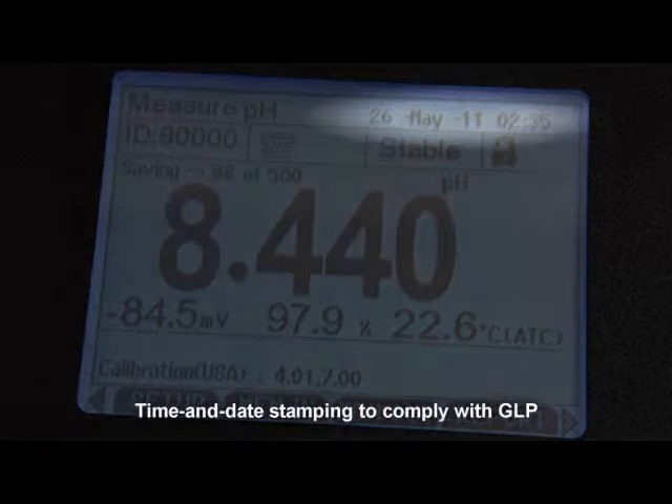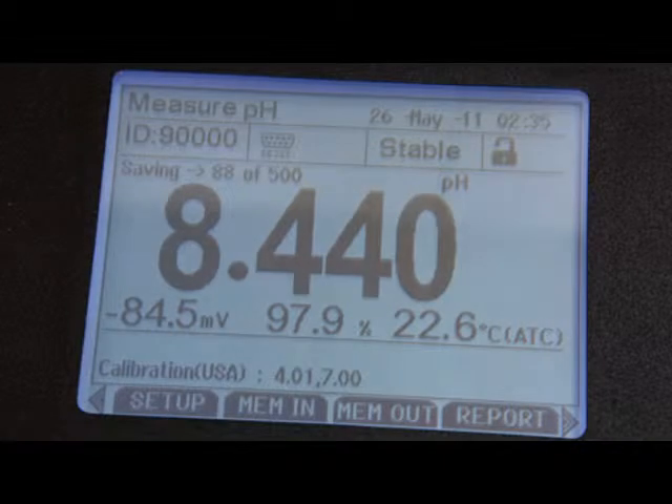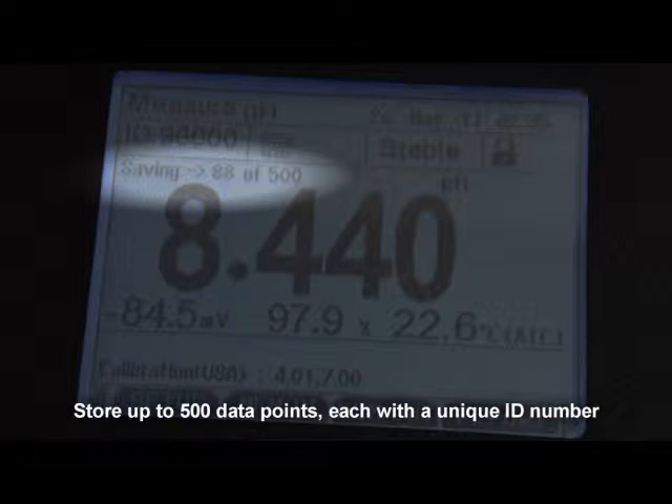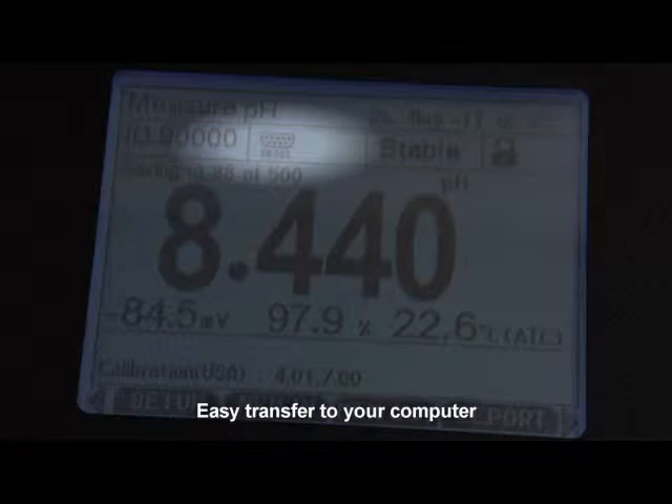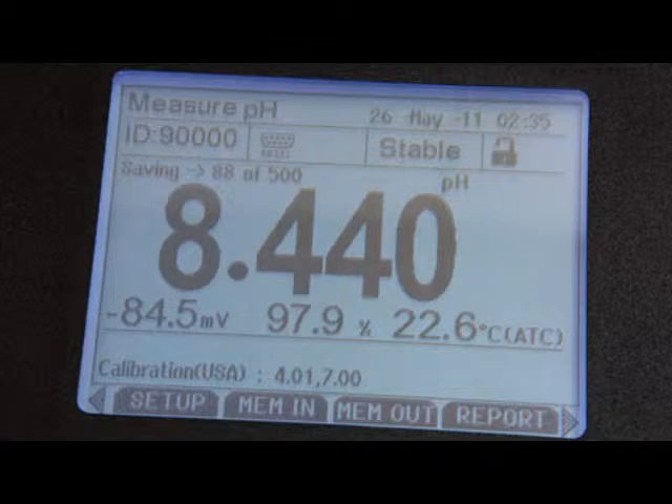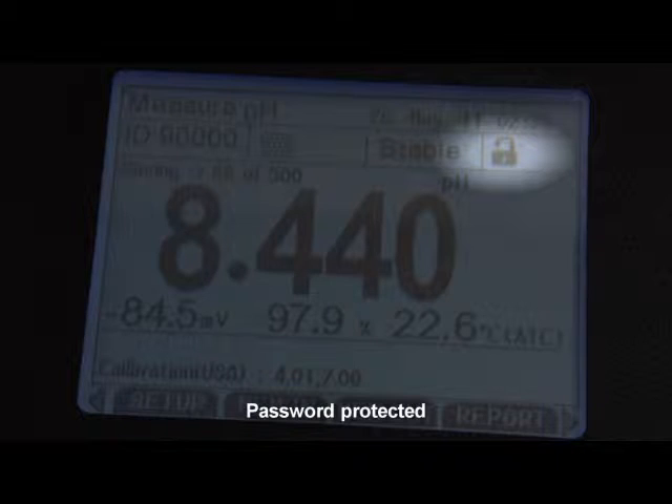Time and date stamping keep you in compliance with good laboratory practices. Record up to 500 data points in the meter's non-volatile memory for later recall. The bi-directional RS-232 output provides an easy interface with your PC for data transfer. And with password protection, you can limit access to the calibration or setup menus to authorized personnel only.